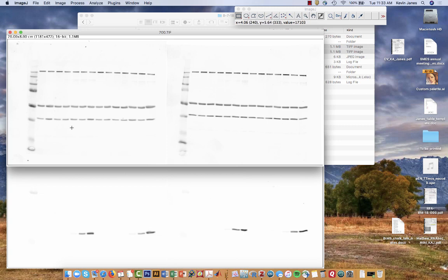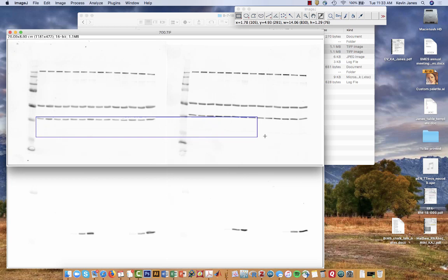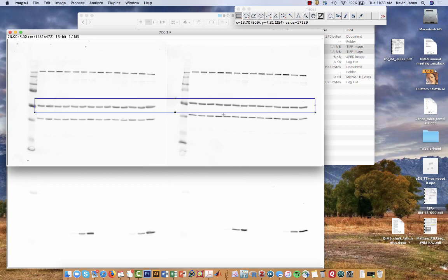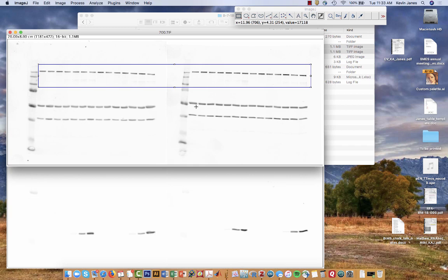What are these bands? For this particular experiment, this lower band is p38 MAP kinase that we're using as a loading control. This middle band is tubulin which we're also using as a loading control. And then these bands up here is the eukaryotic initiation factor EIF4G. We'll do that one last because that one's more complicated. We're going to start with the loading controls first.